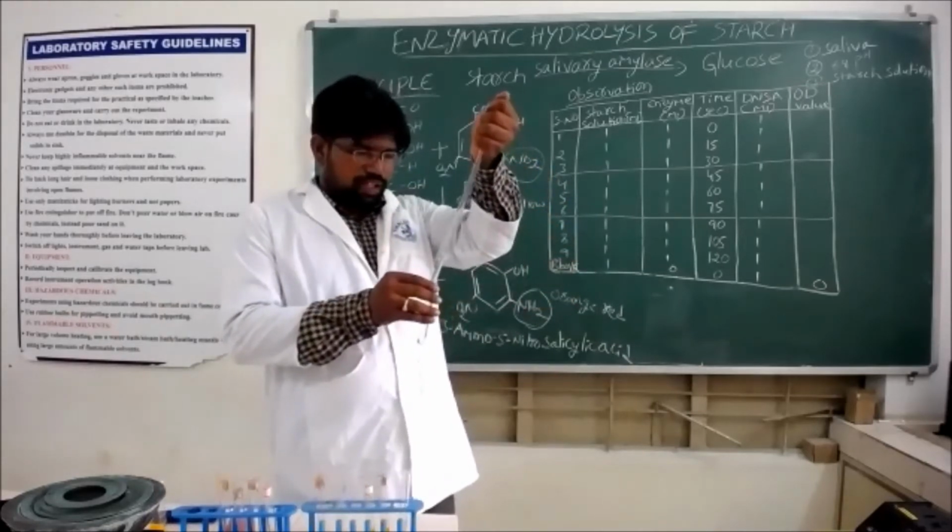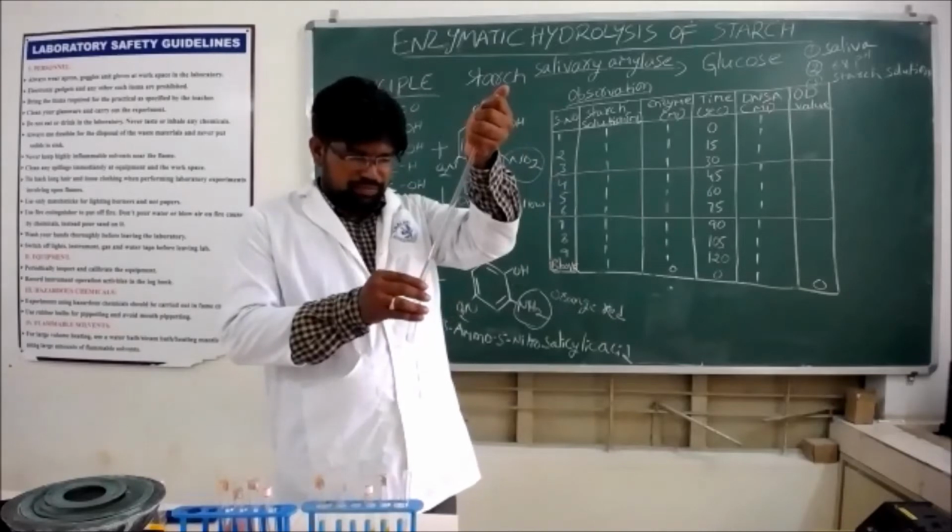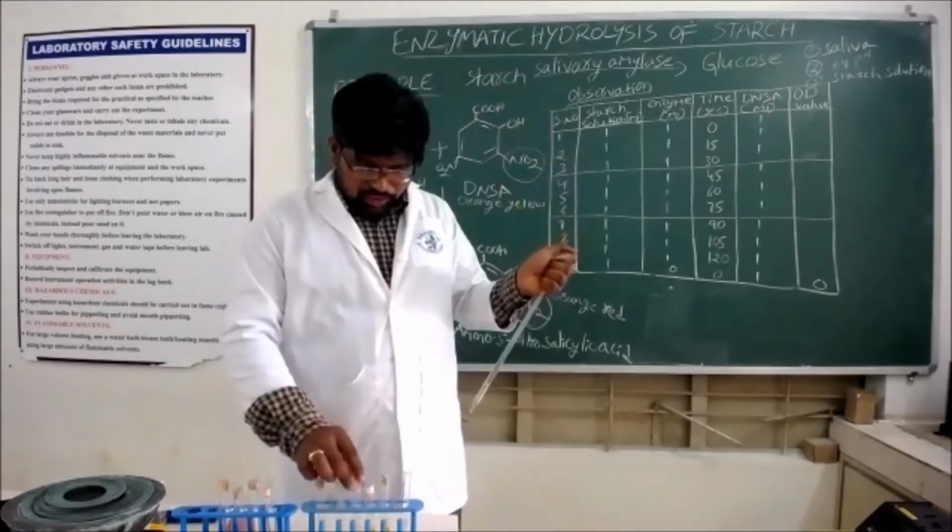So now into the third test tube, add 1 ml of saliva. So wait 30 seconds.